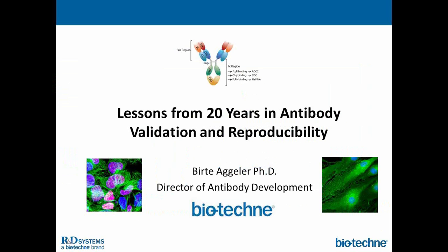chances. When you go to peptides only, the concern I would have is because on IHC you have another level of complication. It's not a soluble method at all. It's cross-linking everything very heavily in the tissue. So going to an extracellular domain, if you can express that, purify that to at least 80% or higher, that will give you a higher chance of success in IHC.